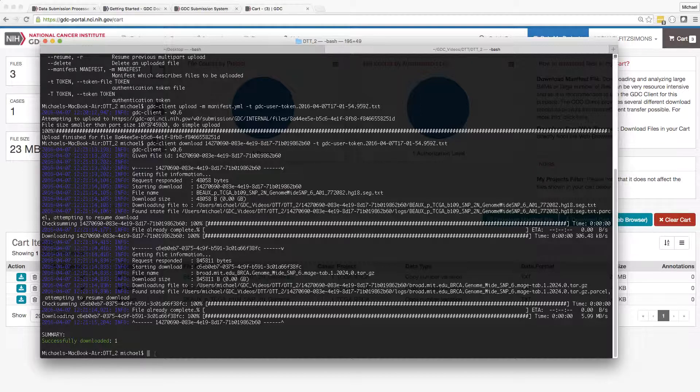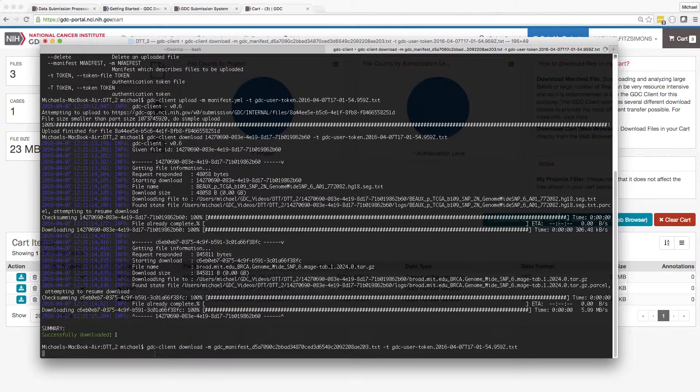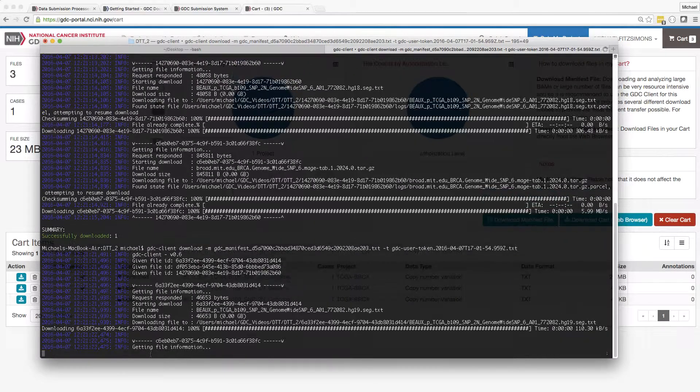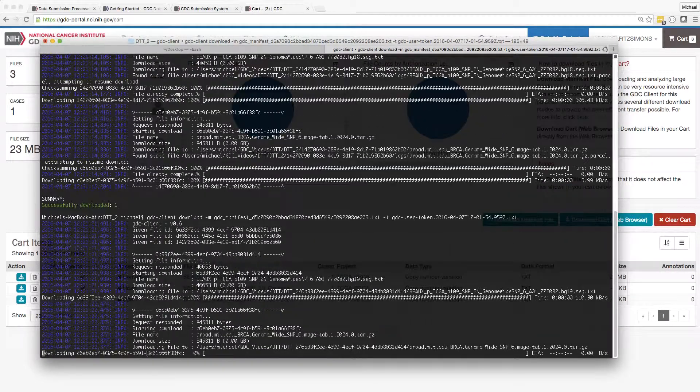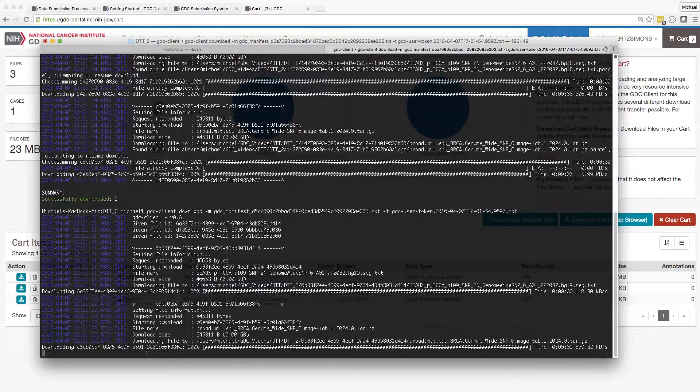In this command, I am downloading a set of files specified in the manifest I recently downloaded.